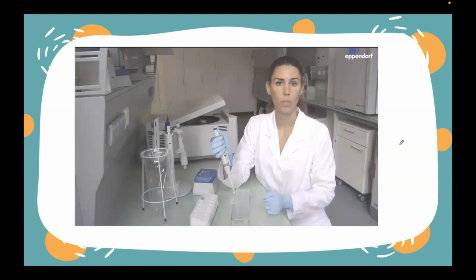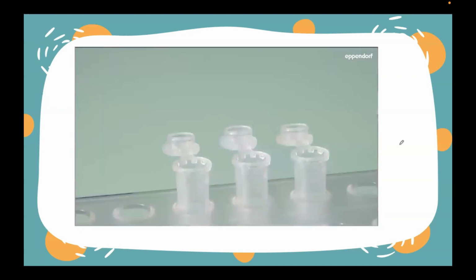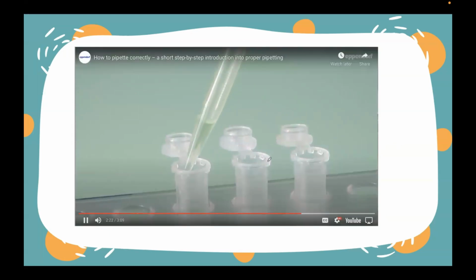This guarantees optimal flow out of the liquid into the target vessel. Press the control button down to the first stop. Ayan, 10 to 45 degrees. Slowly i-release. And then yung second stop, yung blow out.